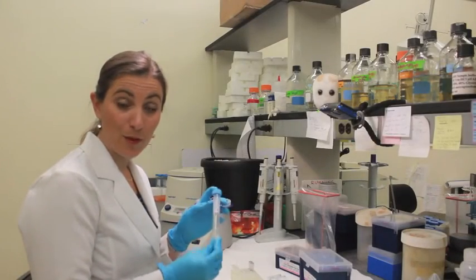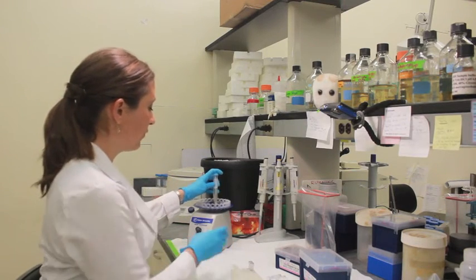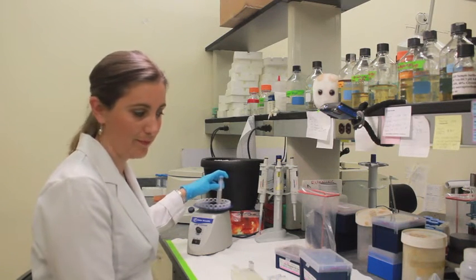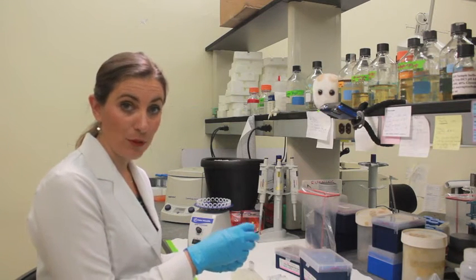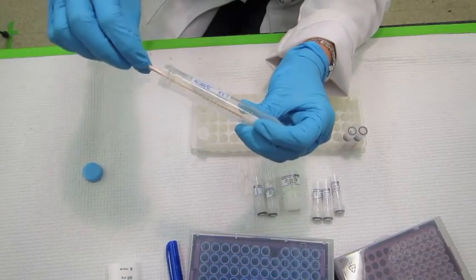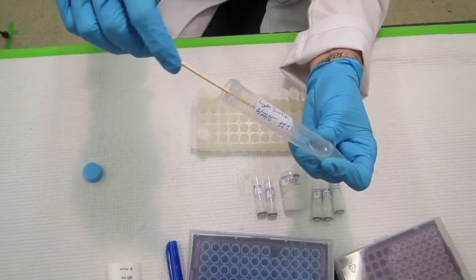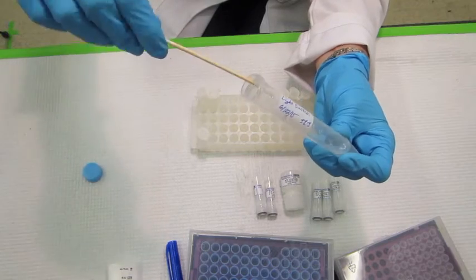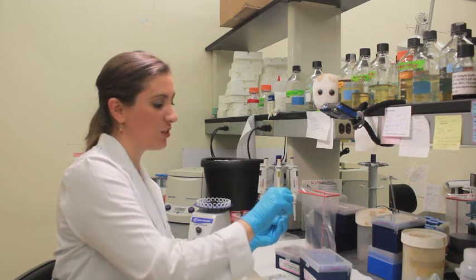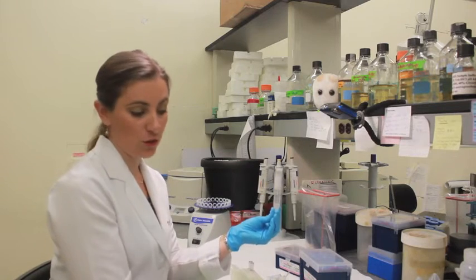We have the swab in the 15ml falcon tube with the swab solution and we are going to vortex it thoroughly to remove all of the material that is on the swab and put it into that swab solution. Once you have thoroughly vortexed the sample, remove the cotton swab from the tube by pressing it hard against the side of the tube, twisting it, and squeegeeing all of the liquid from the swab to leave as much liquid behind as possible. The swab will still be damp, but you should still have about 2ml of swab solution in your tube.